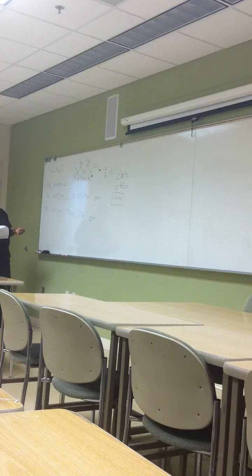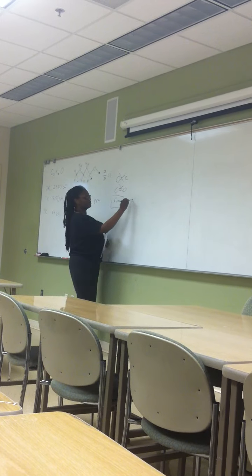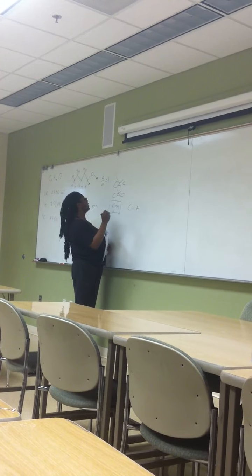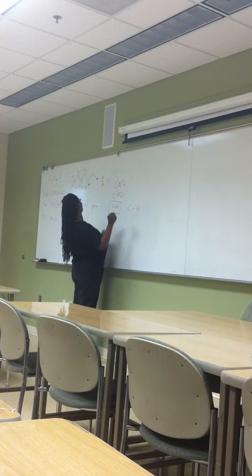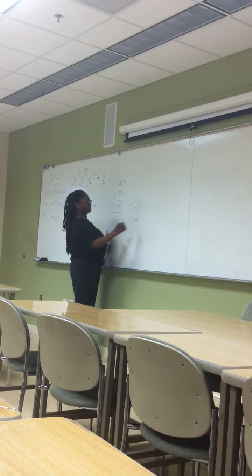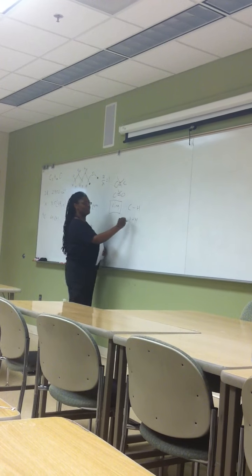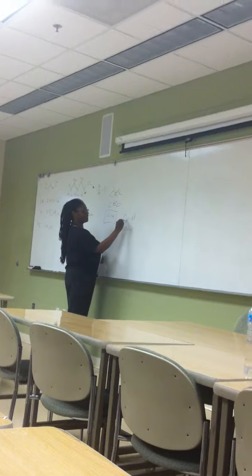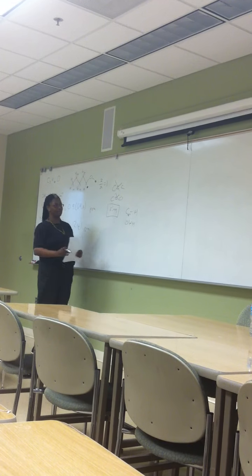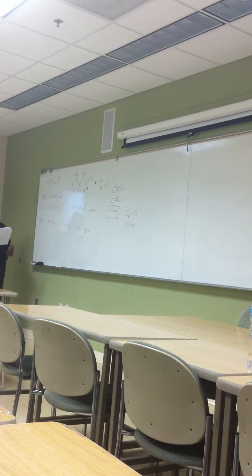Okay, so that means I have no carbon-carbon double bonds, so I could have some carbon-hydrogen stretches. Okay, it's possible I could have an alcohol. Do we have a stretch for an OH anywhere? No, so none of this. So this is going to be an sp3 hybridized carbon-hydrogen stretch because we don't have a double bond here. And that's the 2900, right?